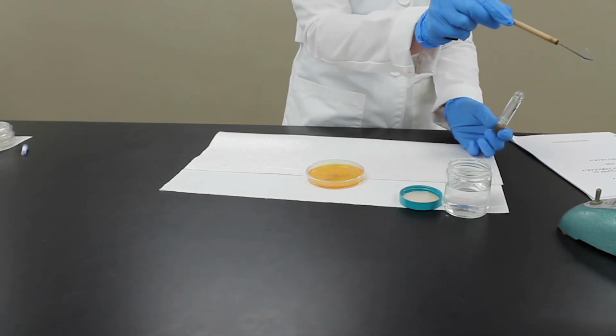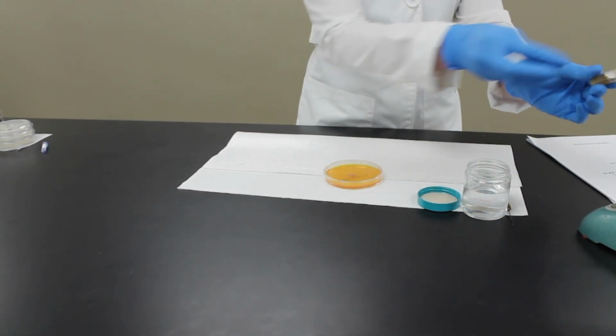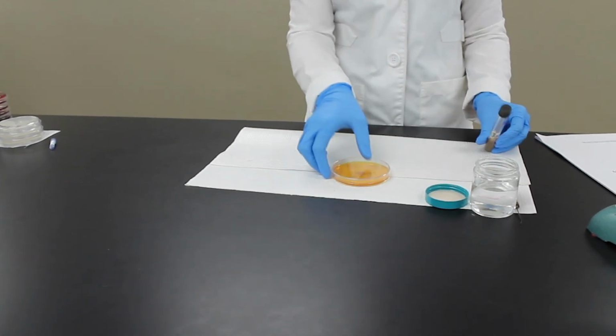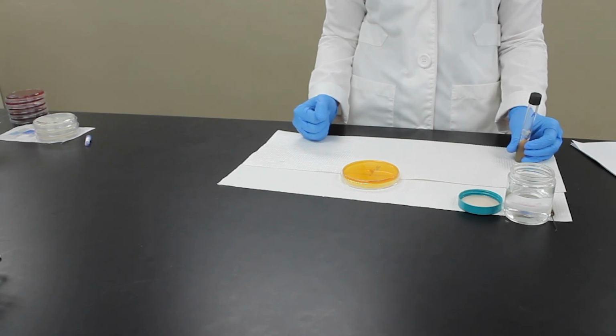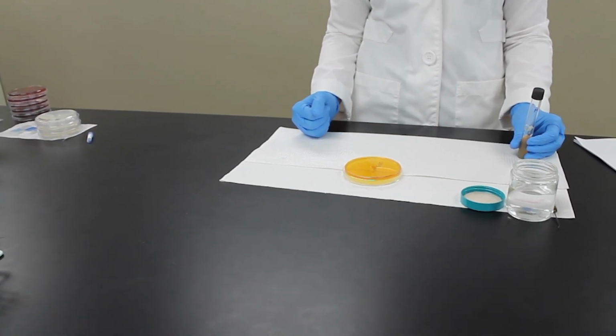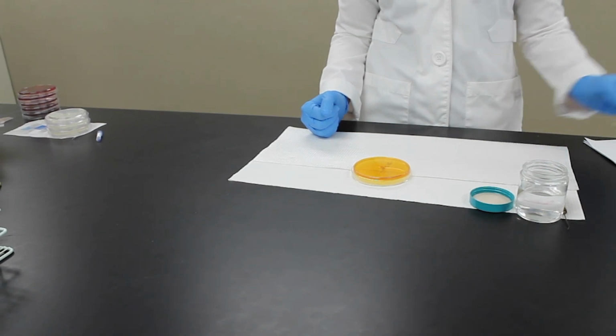So the organism will grow as a mycelium, or a large colony that's going to spread out on that plate, and it's going to produce a color reaction. If it's a dermatophyte, it'll turn the agar a reddish orange color that will be diffusing out from the colony. And we'll have illustrations of this, photographs of this on your Moodle site.